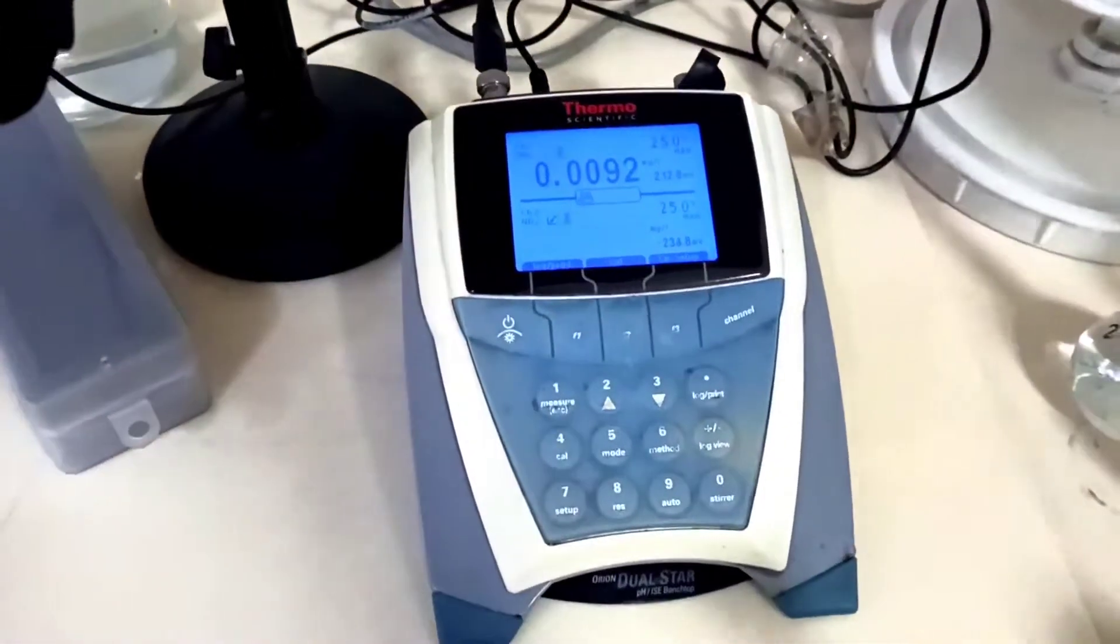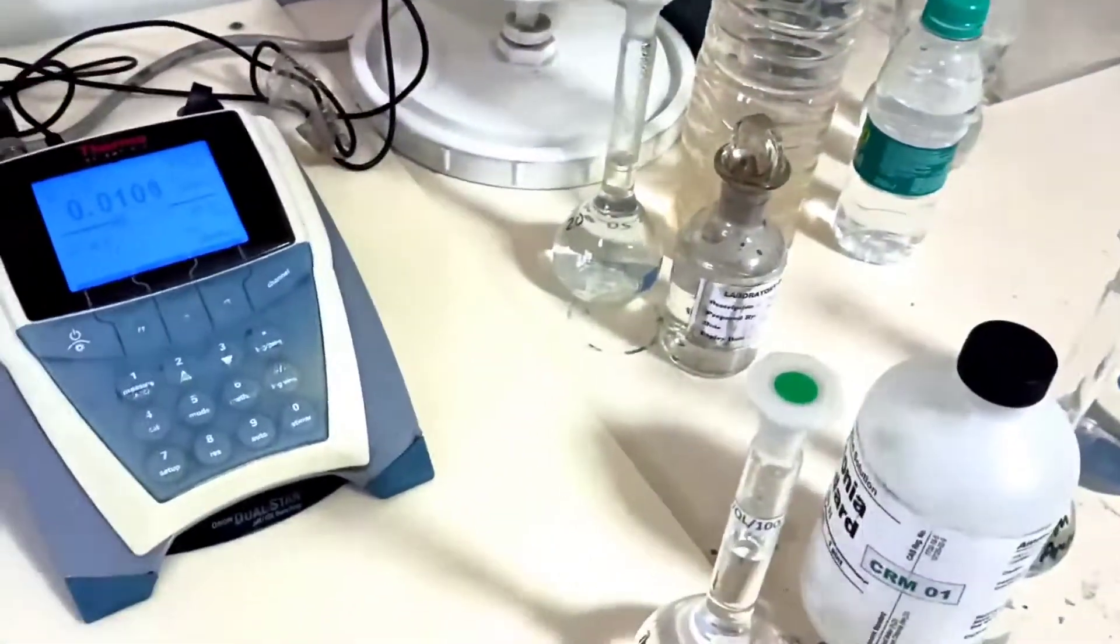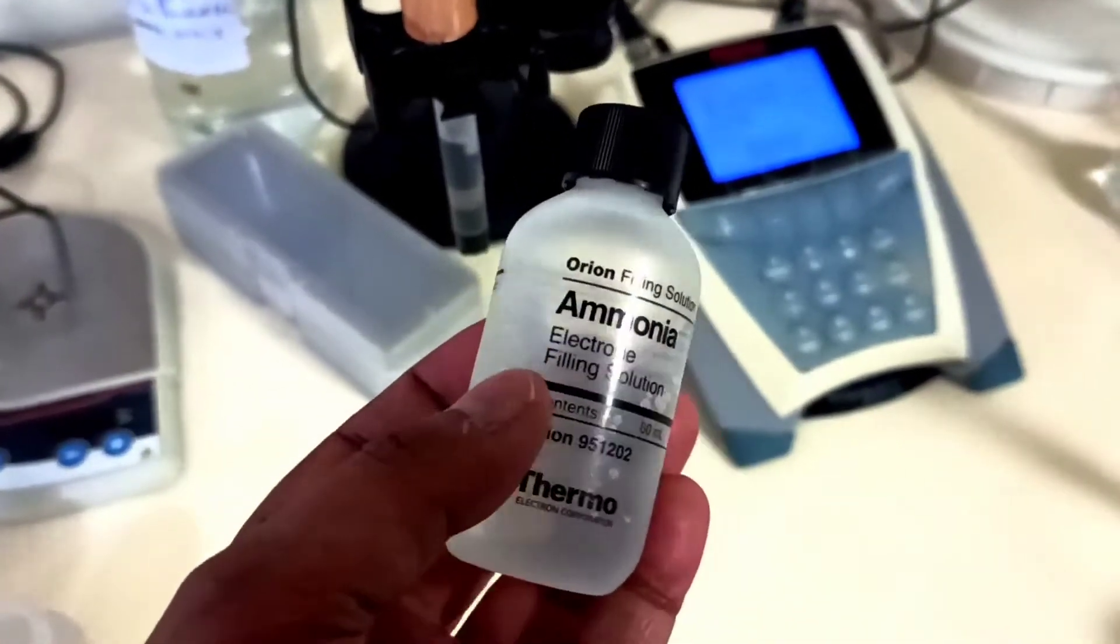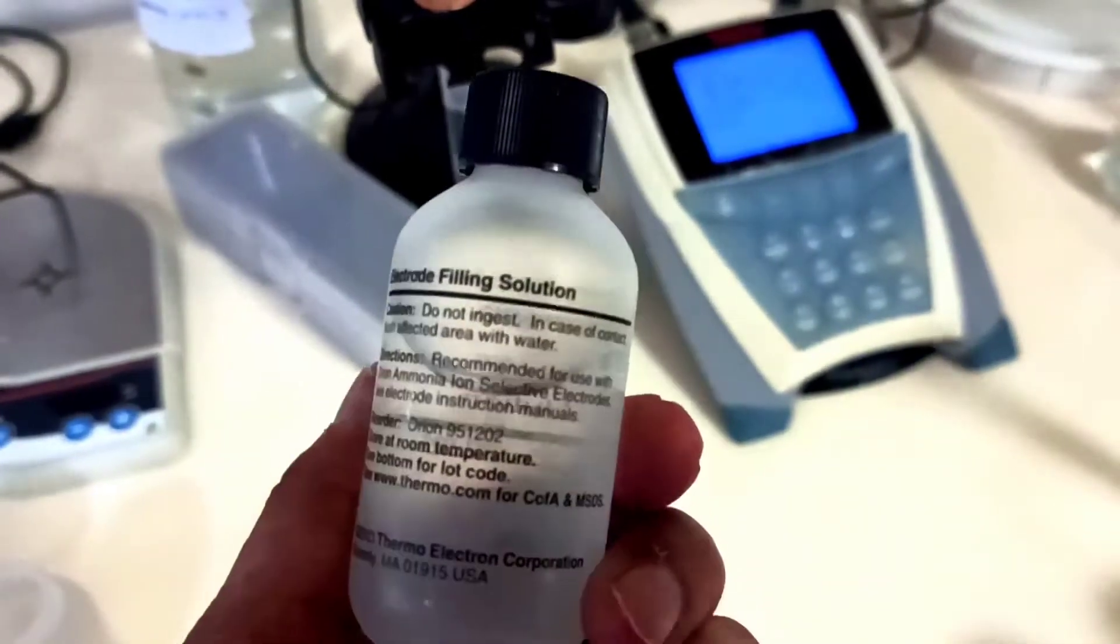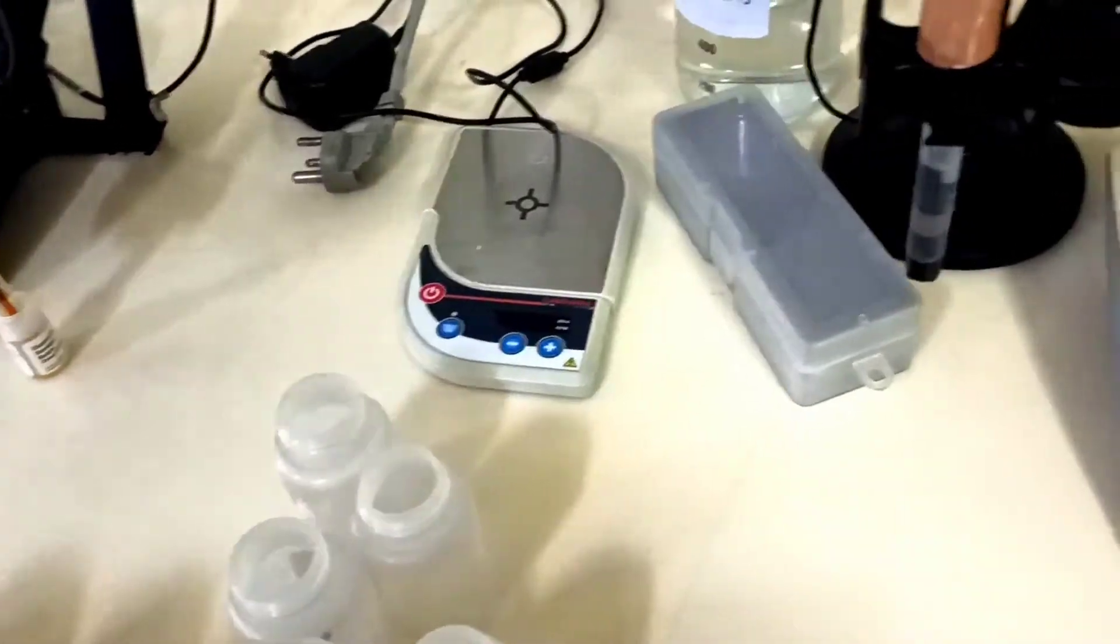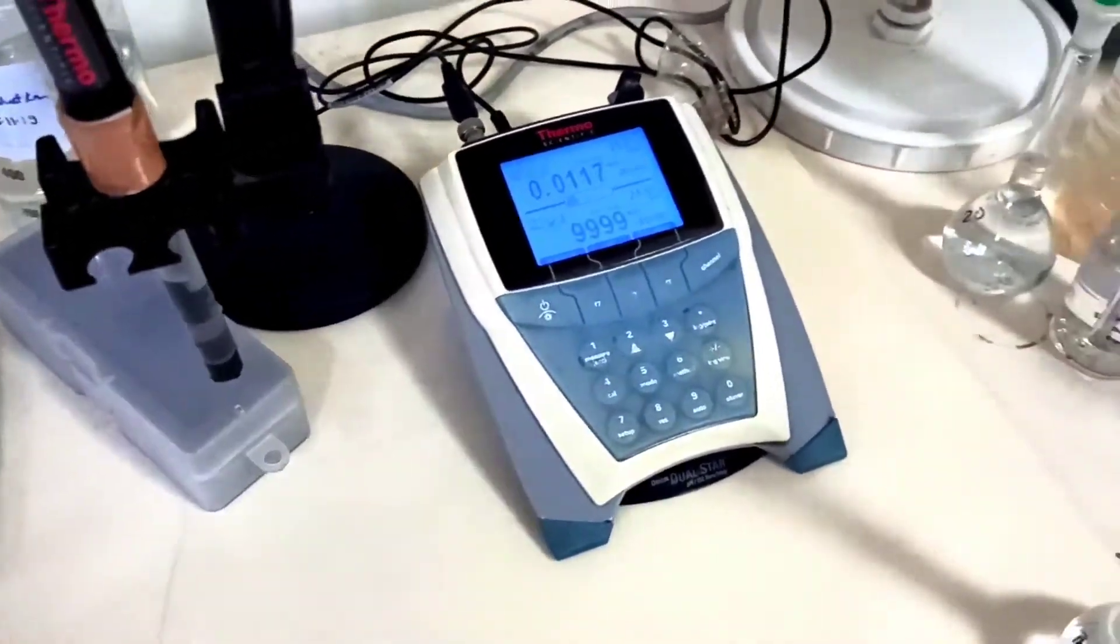In front of me you see the whole setup of the ion meter. It is attached with the ion selective electrode for ammonia. First of all, you see the ammonia electrode filling solution. We will show you how to fill the electrode filling solution in the ammonia electrode. This is the whole setup for calibration of the ion meter.